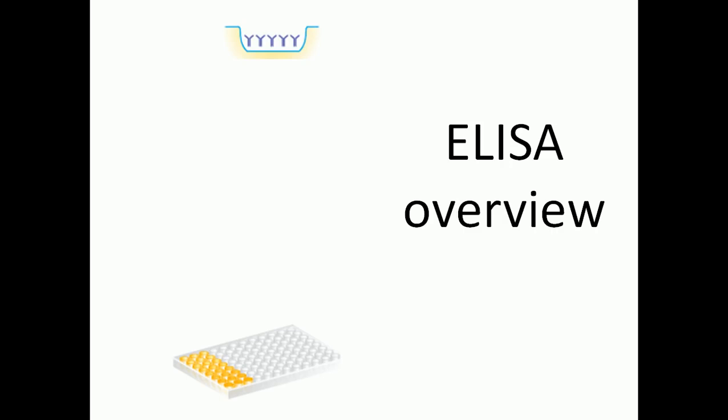In this type of wells, we can add the sample now, because our sample may contain antigen. If our sample contains antigen of a particular infection, we can diagnose that particular disease. So let's add that antigen. Here the antigens are depicted with these triangular shaped molecules. Once we put the antigen in place, those antigens will specifically interact with the antibodies that are adhered to the bottom of the wells. Once they adhere there, we do a washing stage each time, for the unbound antigens to be washed away.